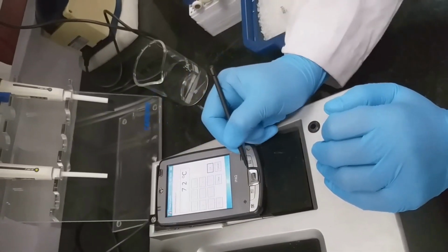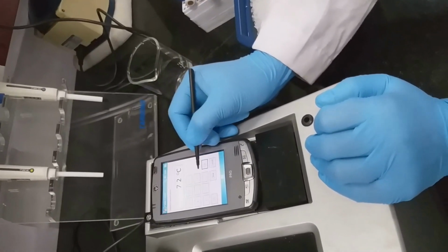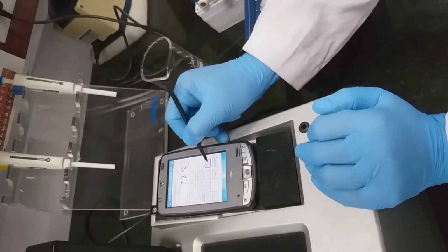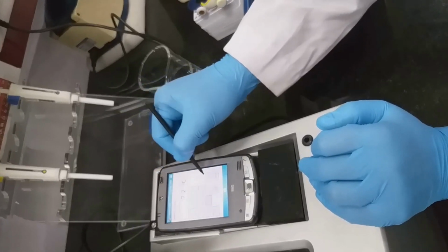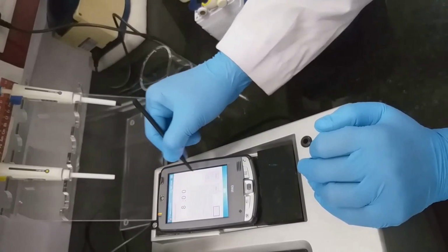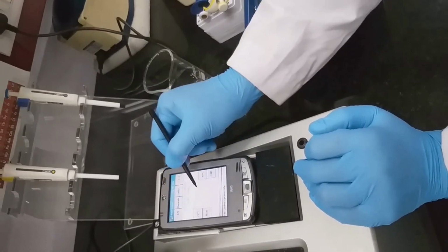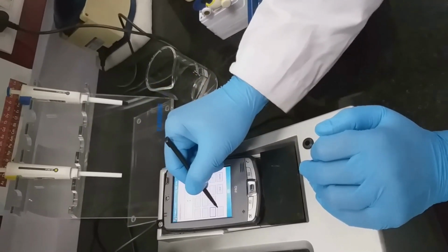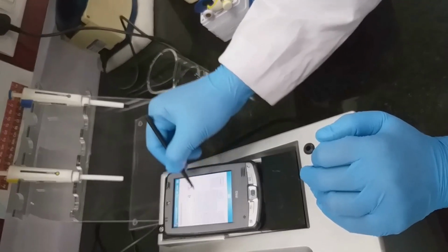Extension time should be given 1 minute per kb. And here the final extension should be given 10 minutes and hold at 4 degrees Celsius.